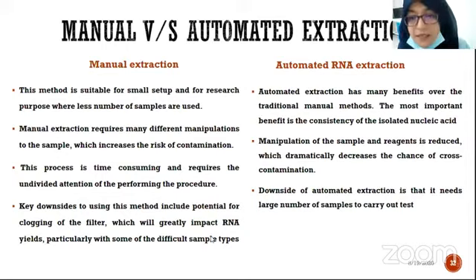One question is how long we can use the mixture of carrier RNA and AVL buffer. We prepare, before starting our experiment, the carrier RNA and AVL buffer mixture. So it is recommended that we use this within 48 hours and keep this carrier RNA AVL mixture solution at 2 to 8 degrees centigrade only for 48 hours, not more than 48 hours.